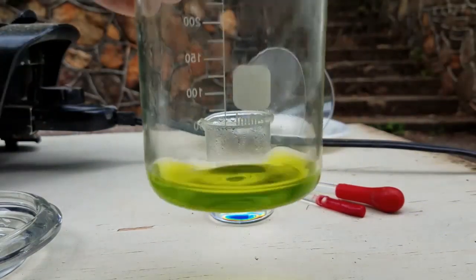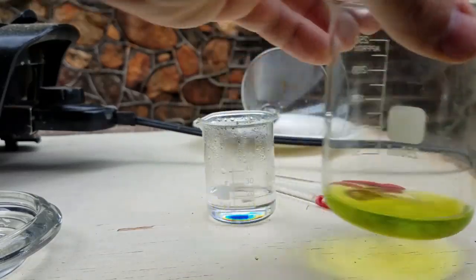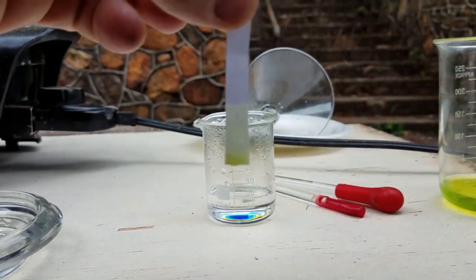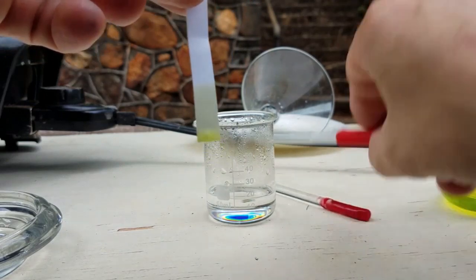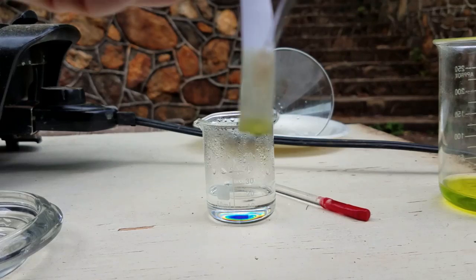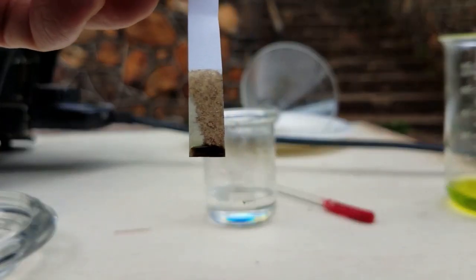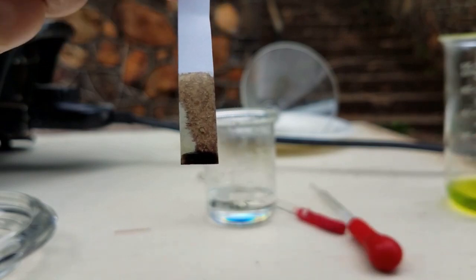Okay, I have a solution with gold content — now let's check how tin chloride works. Just a little bit of tin chloride. Oh my goodness, there is gold in the solution — can't believe it!